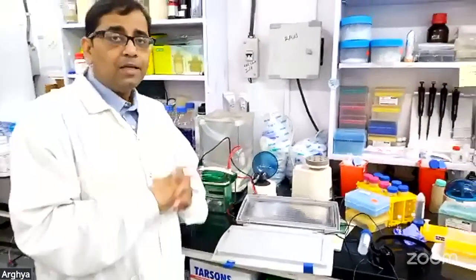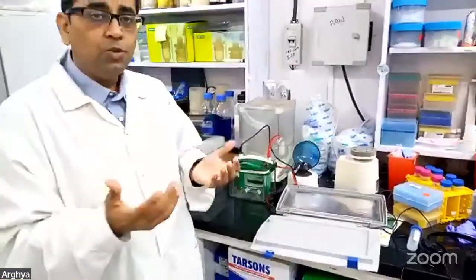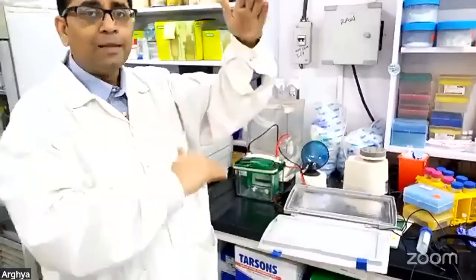For example, think about your SDS-PAGE. When you run SDS-PAGE, your proteins are boiled, and you prepare your complex sample so that there are no disulfide bonds. That reduction and alkylation you do before you run the SDS-PAGE, so the proteins get separated well.